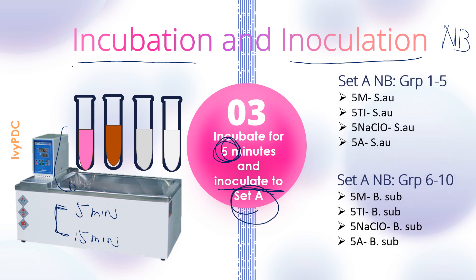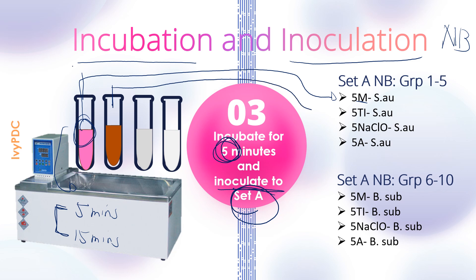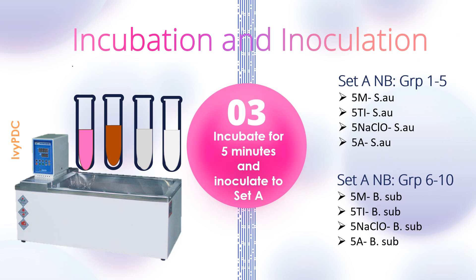These nutrient broths are the ones previously labeled before the experiment started. After five minutes, transfer a loopful of the chemical with the organism into the nutrient broth labeled as merthiolate, then from the tincture of iodine, another loopful into the tube labeled 5TI, and so on. Groups 1 to 5 will have S. aureus and groups 6 to 10 will have B. subtilis. Make sure to only remove the test tube from the water bath when ready to inoculate, and return it immediately after inoculation so incubation continues.